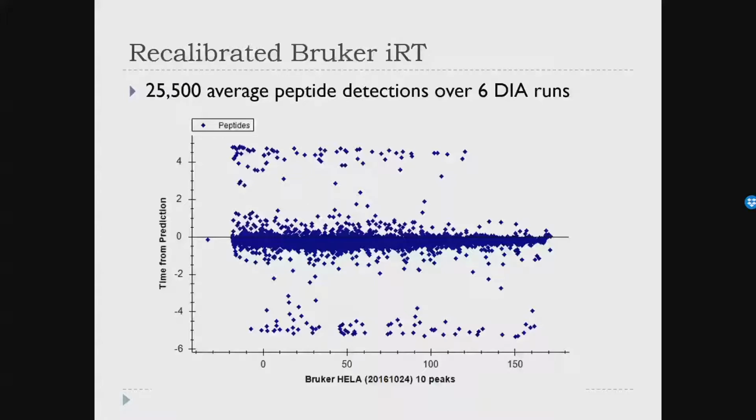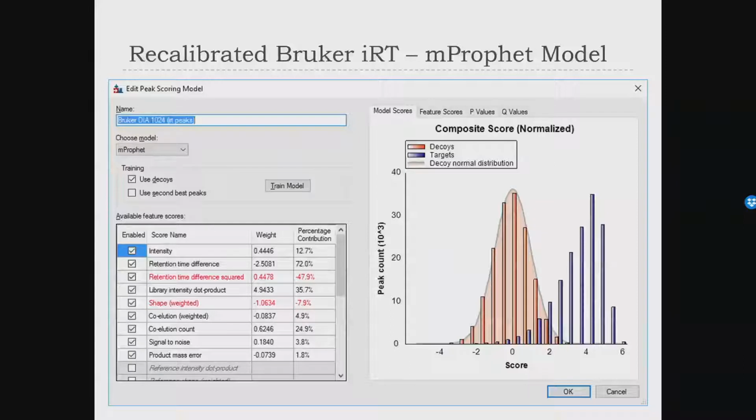Yeah, it's not just random outliers, right? There are these two lines. For some reason, outliers like to go pretty far away. And again, this is my 5-minute mark. I have only given myself 10 minutes to do this. So the fact that they're going out to the end is something weird, which I can now explain. But at the time, I was like, what is going on there? But once you do that, retention time becomes a really powerful score.